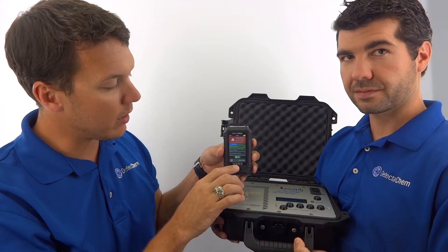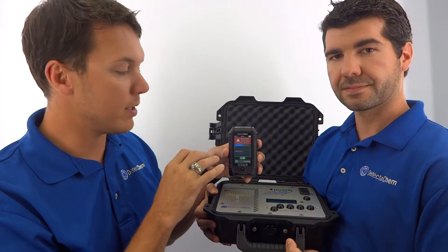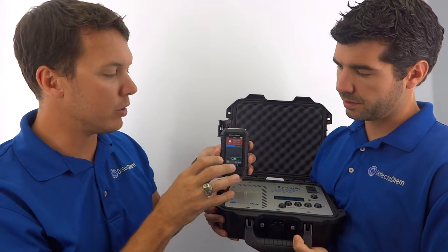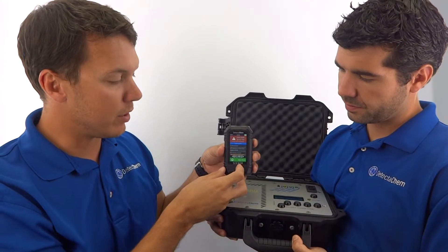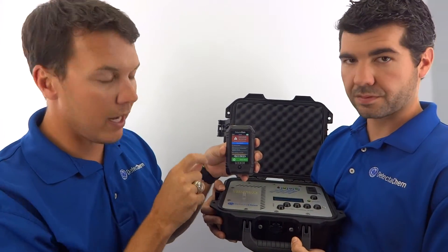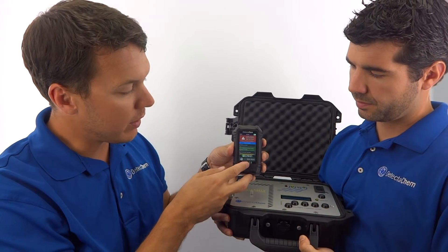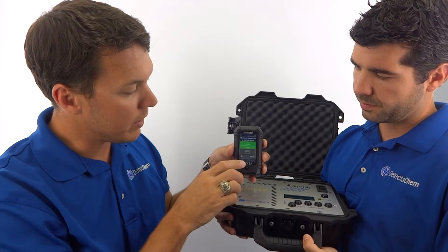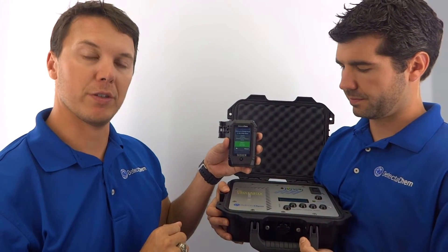We're continuing to analyze with the Seeker E, taking further detection and measurements. You can see the line is deviating, meaning we have more color change. That beep you just heard is the finishing of the detection, and you can see we've got a strong indication for group 4 or 5. Clicking on group 4 or 5, we can see that in group 5 we've got TATP — which is what we released from the microsphere heater.